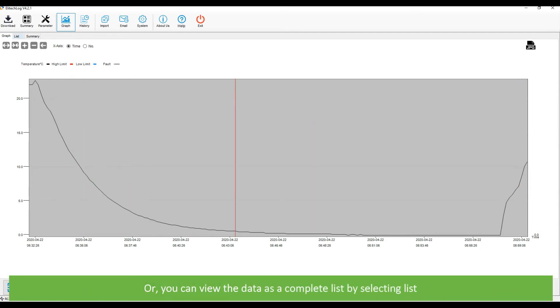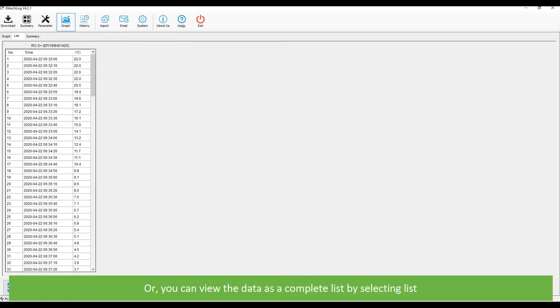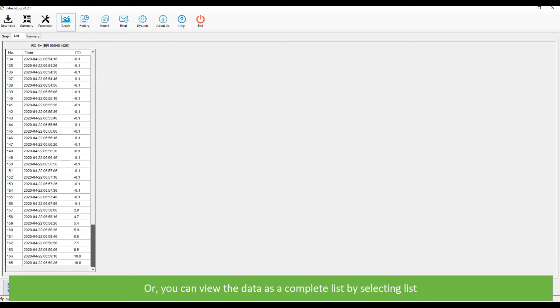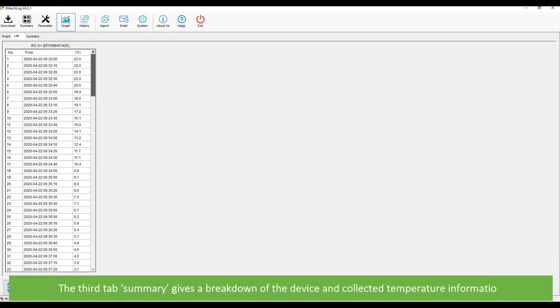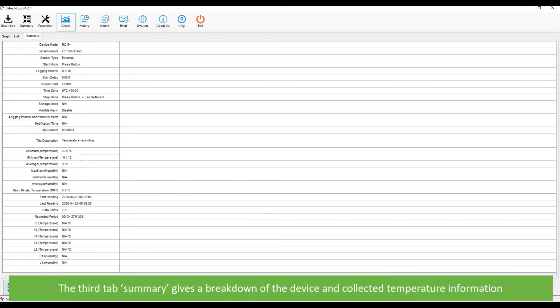Or you can view the data as a complete list by selecting list. The third tab, summary, gives a breakdown of all the device and collected temperature information.